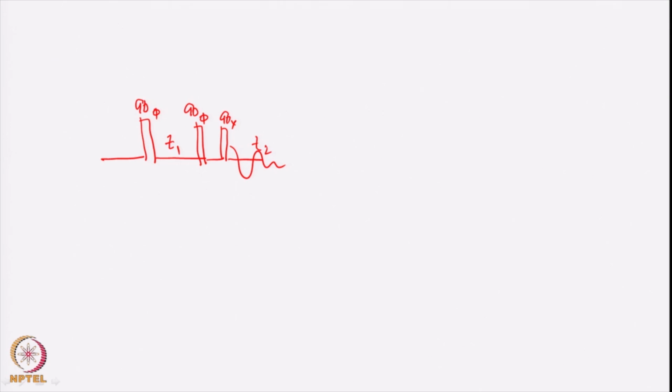This is called the double quantum filtered COSY. And this is very similar to the COSY which was also discussed in the previous classes, and that was just this. You have a t1 period here and a t2 period here, just one pulse less, and this is 90x 90x, but we could have other things as well. In doing so, we actually demonstrated how double quantum filtered COSY produces some features which are very advantageous compared to the COSY, especially in the diagonal of the 2-dimensional spectrum.